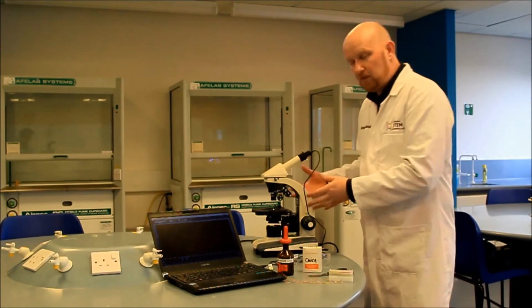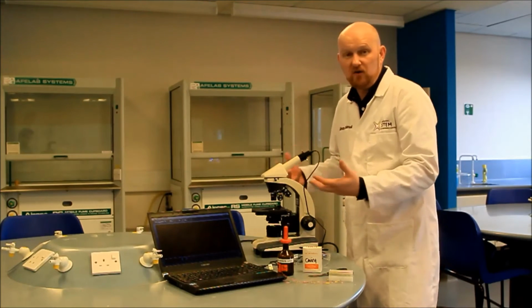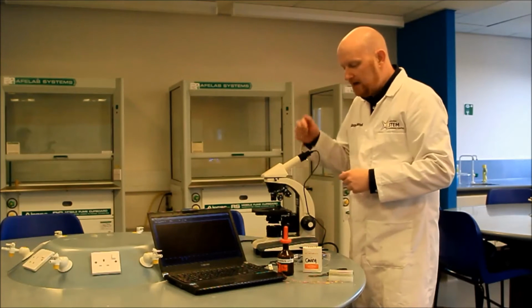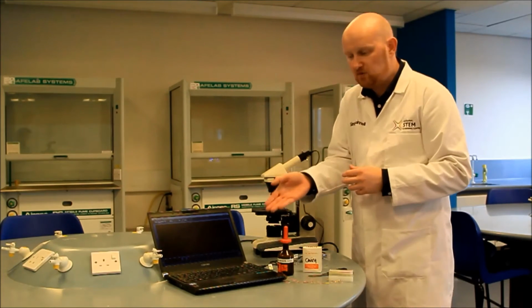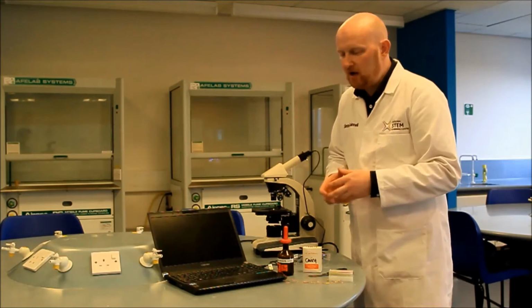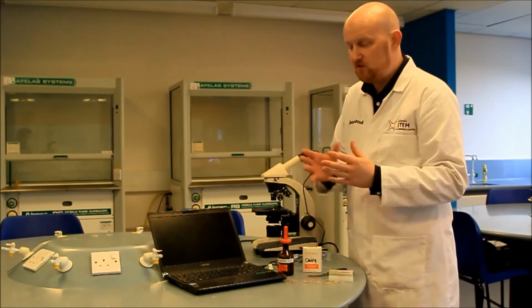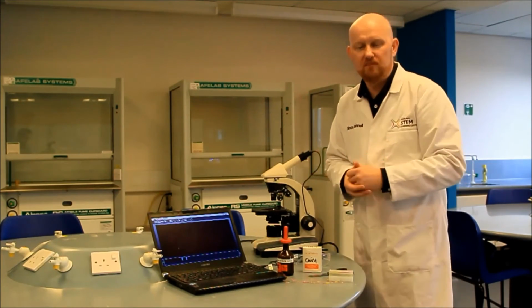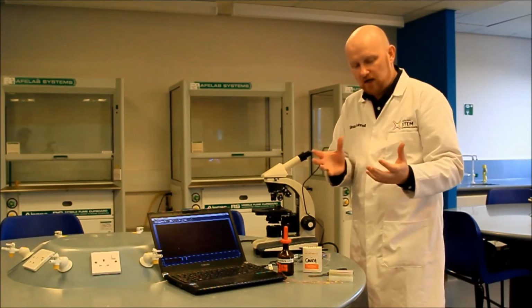We've also got the microscope here. This is quite a nice microscope, so we've got different objectives here we can use. I've tied that in with a camera to my laptop, so you'll be able to see these crystals growing. They are more defined if you look under the microscope, but for the class to see them, if you're doing this as a demo, you would need to transmit them and put them up on the screen or a laptop, for instance.